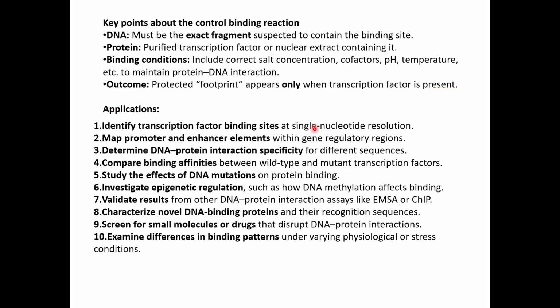So, what are the applications for these? It helps in identifying the transcription factor binding sites at single nucleotide resolution. The resolution is so good that even the difference of one single nucleotide in binding can be identified. Then map promoter and enhancer elements within the gene regulatory sequence. You can map your regions in your gene and determine DNA-protein interaction specificity for different sequences, like if the same protein is binding to many sequences, which has more affinity or which DNA sequence it is specific for.